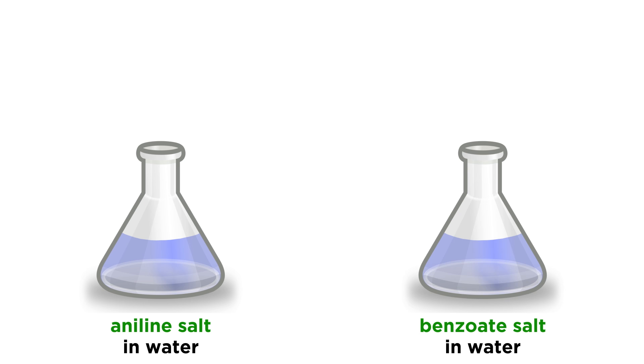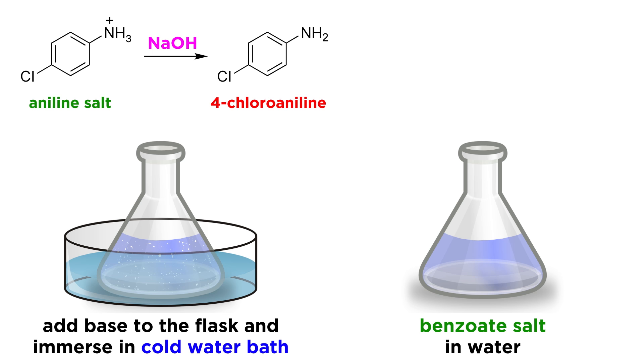The other two substances will be a little tricky, because they are now salts, so we have to do a little more chemistry. The aniline salt needs to be deprotonated, so we need a strong base, like sodium hydroxide. Let's add some of it to the flask, immerse it in a cold water bath, and watch the 4-chloroaniline precipitate. We can be sure that this is finished by checking the pH. Once all the salt has reacted, then no more hydroxide can react, and it will thus remain in solution, and the pH should reflect that, reaching around 11 or 12.